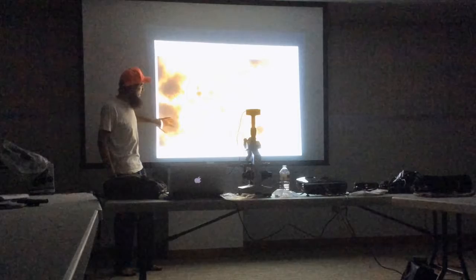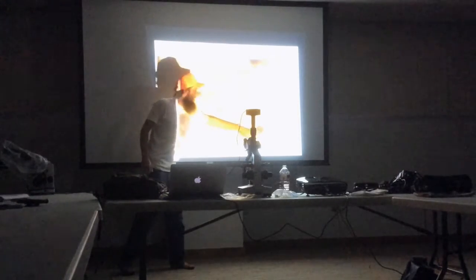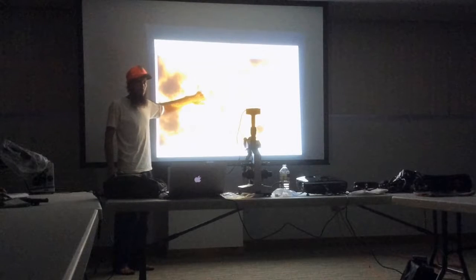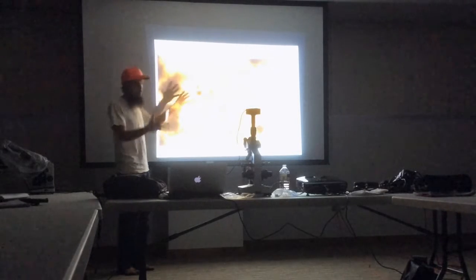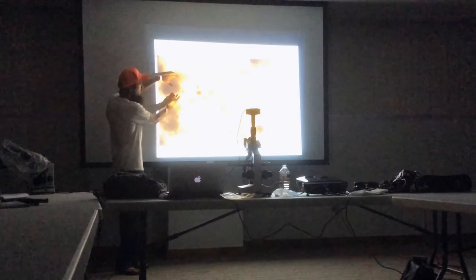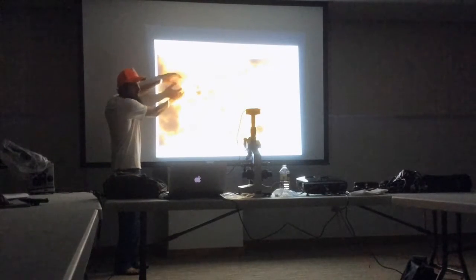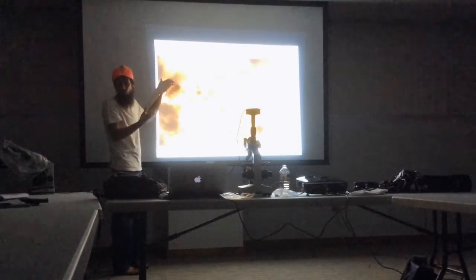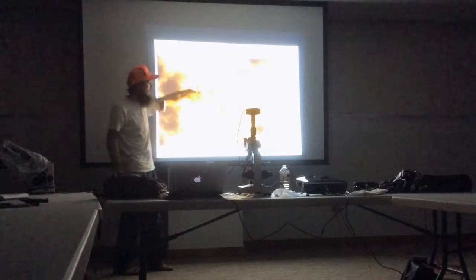These big clumps out here, when you're looking at this sample, you would call this an aggregate. When something is stuck and clumped together like this, it's an aggregate. So this is just a bunch of bacteria glued together on some particles of dirt or other minerals and things in the soil that are glued together.